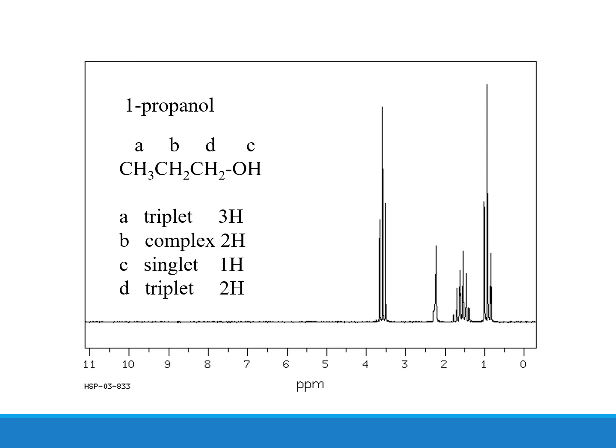Actually, the A methyls are also triplets, D are also triplets, okay, but D and A have different electronegativity influence. So the triplet for D is the one that has higher chemical shift, and the triplet for A is the one that has lesser chemical shift.